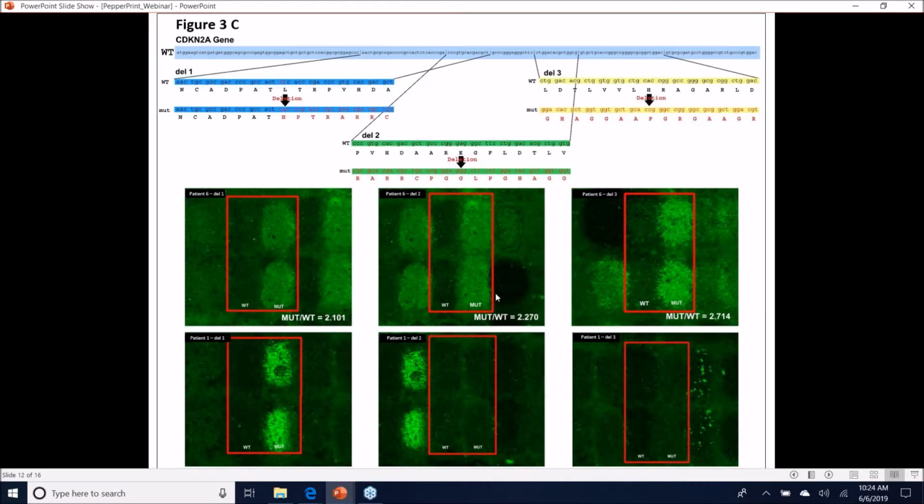This is not necessarily surprising because, depending on protein abundance, or depending on the presence of different HLA that can bind to different peptides, or many other factors, you can imagine there'll be significant patient-to-patient variability.